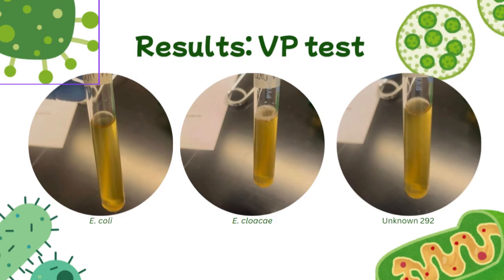It is a little bubbly. That is from us trying to fix it and see if we could get results. Maybe the bacteria wasn't touching the right spots, but it should have been a positive producing that acetoin, a butanediol pathway. The gram-negative has no apparent color, so it could mean it's a negative or the test wasn't correctly done.